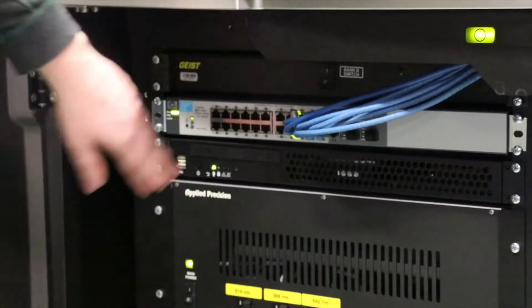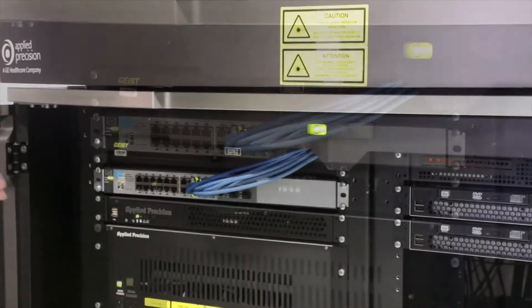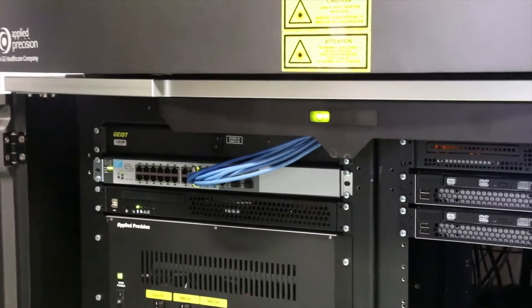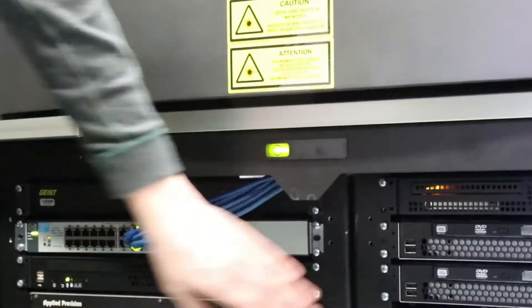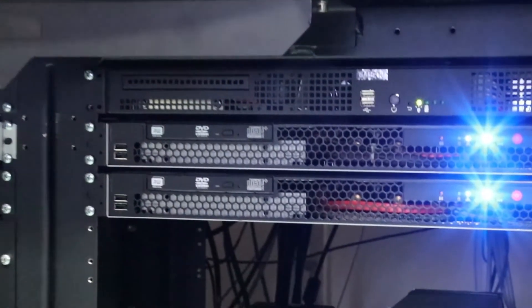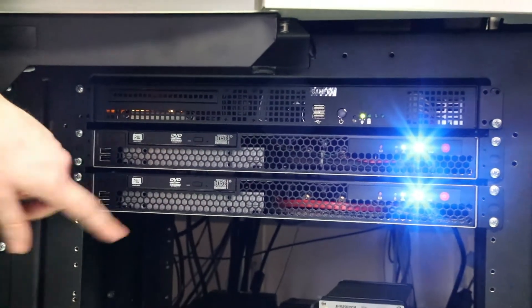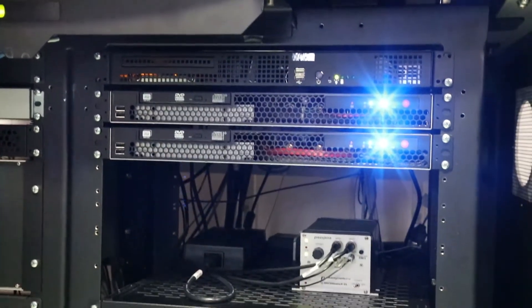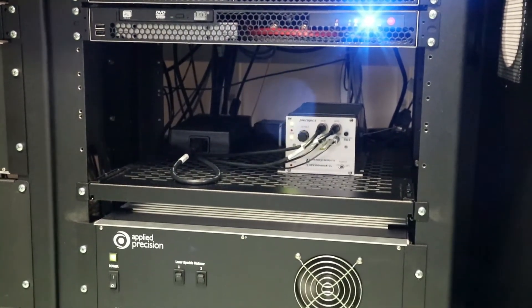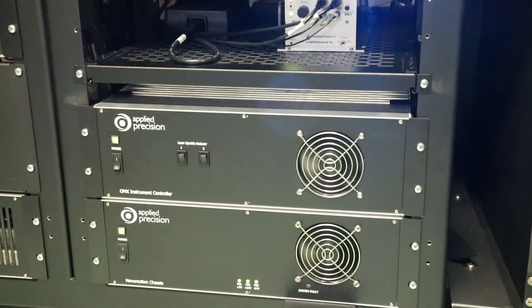There's a network switch that basically allows all the camera computers to transmit their data. Below it is a computer that controls a lot of the components — just sends commands on what to do. On this side, we have one computer for each camera. Those have two solid-state drives, just to get as much speed and data throughput as possible. Below that is a piezo controller for the Z-axis. And then the other two chassis — the instrument controller and nano motion chassis — basically provide power and control to multiple different components like the different motors and things like that.